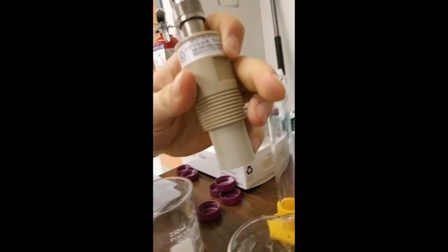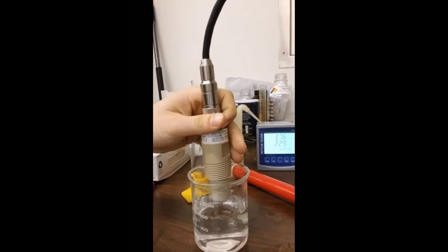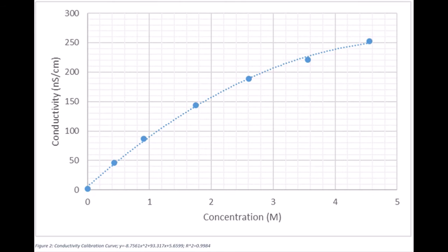We created this by testing the conductivity of water with different amounts of NaCl to create a graph relating the conductivity and the concentration. The conductivity meter was quite random sometimes, and the values in the center of our graph aren't great, and we believe that this will account for some error we find later.